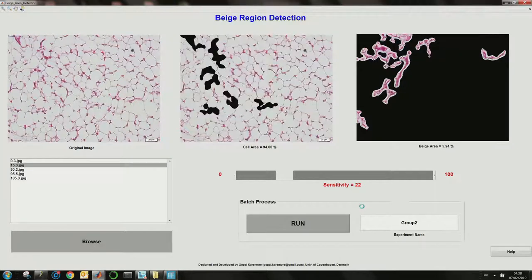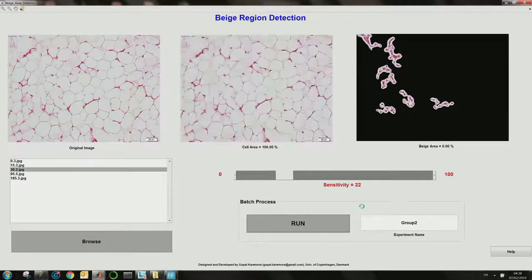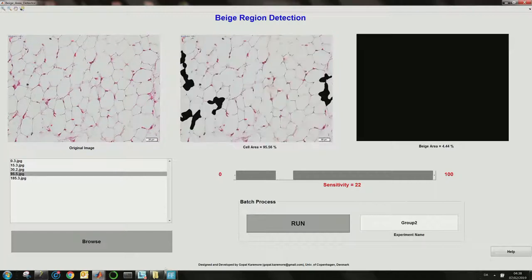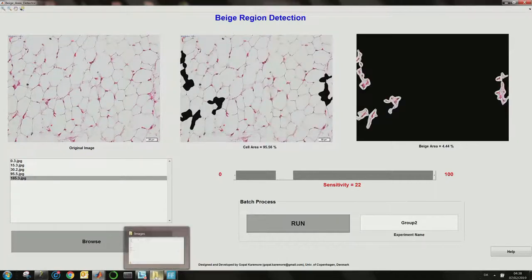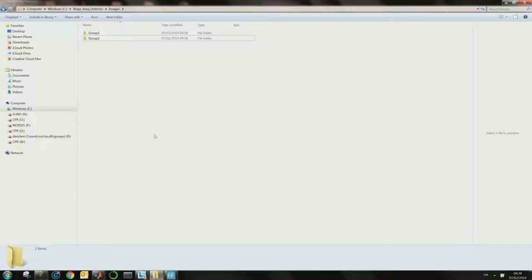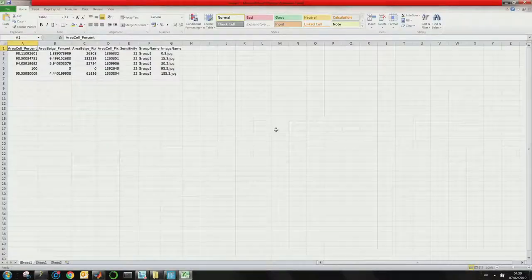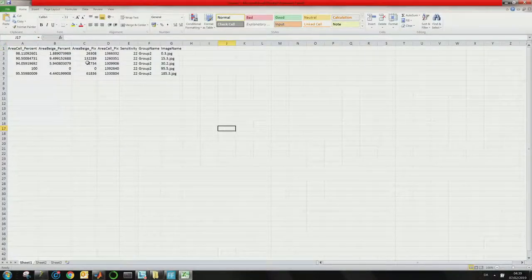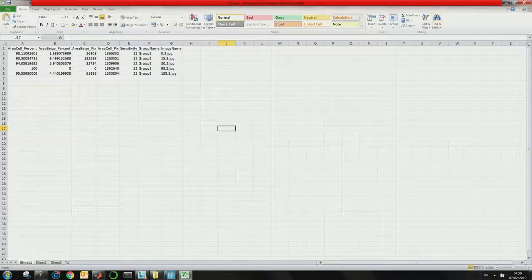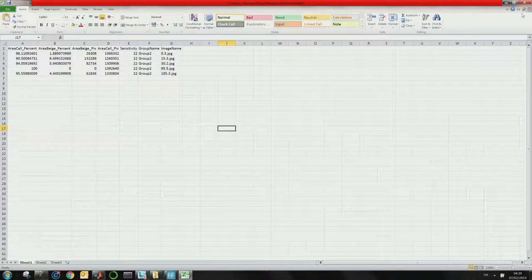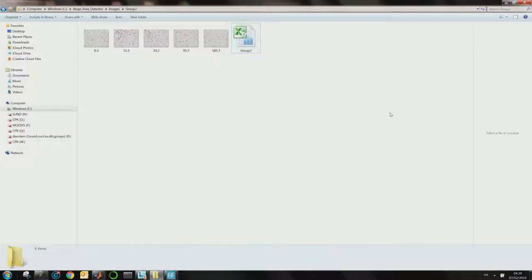After waiting for the processing to complete, the group two file will be saved with the same features. One can then concatenate group one and group two, which is especially useful if you are using statistical software — this is very useful for downstream analysis.